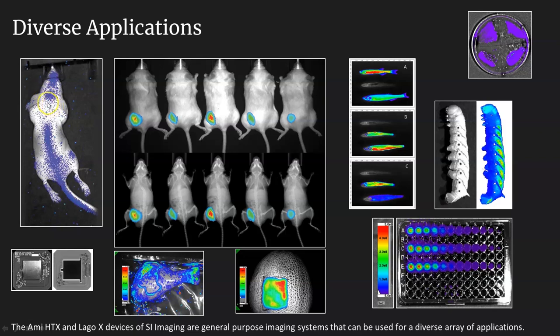So how does it work? Basically, you have the positrons that are emitted by the radionuclide interacting with tissue electrons. And these electrons and positrons come together in an annihilation event. And from that, high energy photons are generated. These high energy photons are traveling at speeds greater than visible light through the tissue. And as such, they leave a wave of blue light. Now, this is a surface biased application, as we know, because blue light does not travel far through tissue. That being said, there are a variety of applications for which Cherenkov imaging has its purpose.